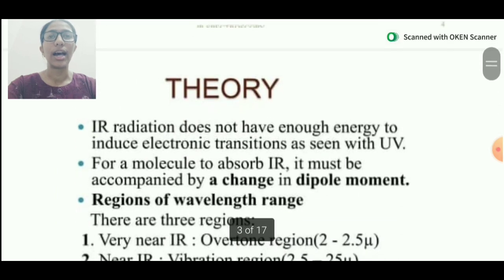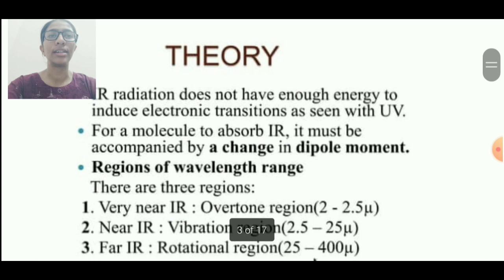Theory. IR radiation does not have enough energy to induce electronic transitions as seen with UV. For a molecule to absorb IR, it must be accompanied by a change in dipole moment.